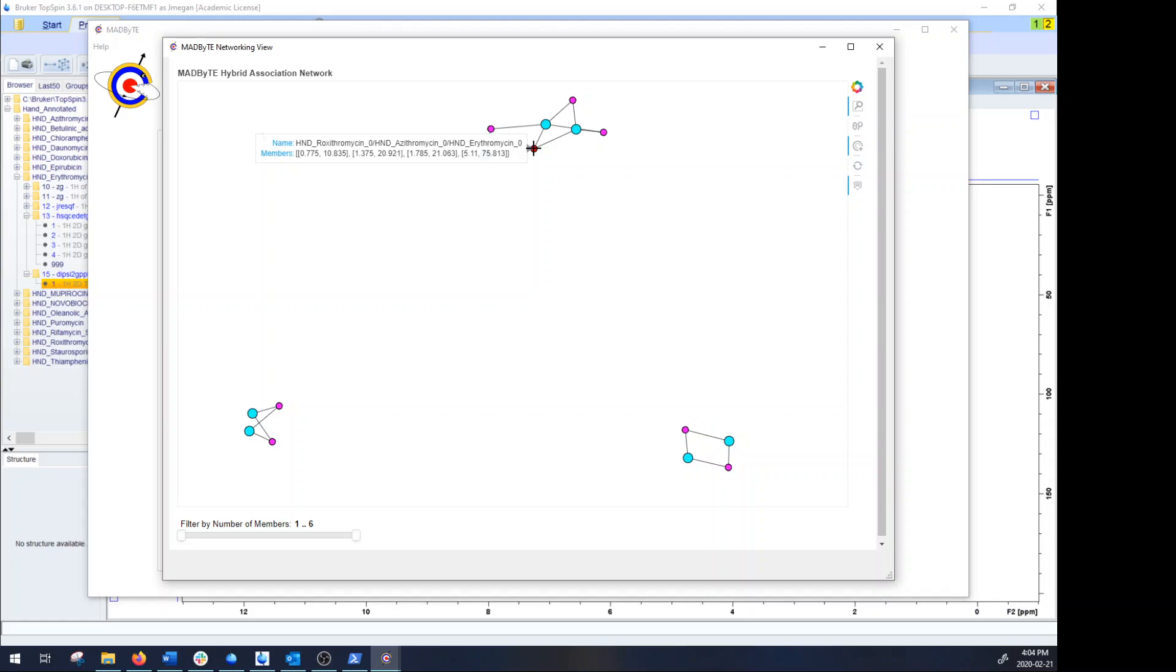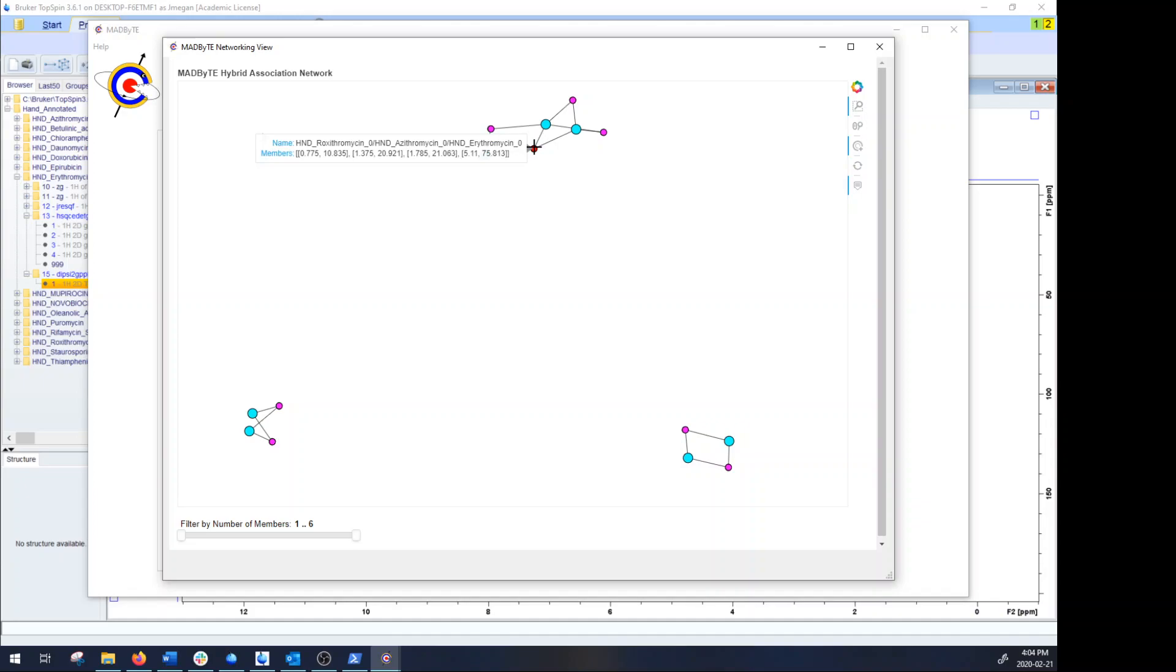So for instance if you were looking for a new scaffold type, you may want to keep an eye out for something like this that's shared between a lot of different extracts.